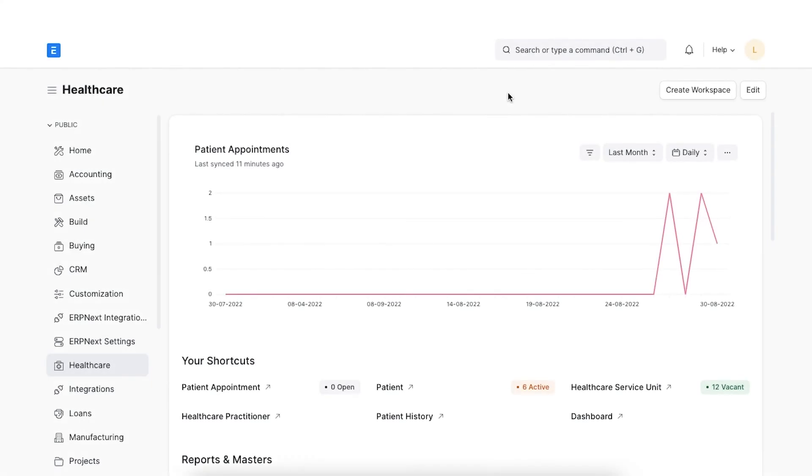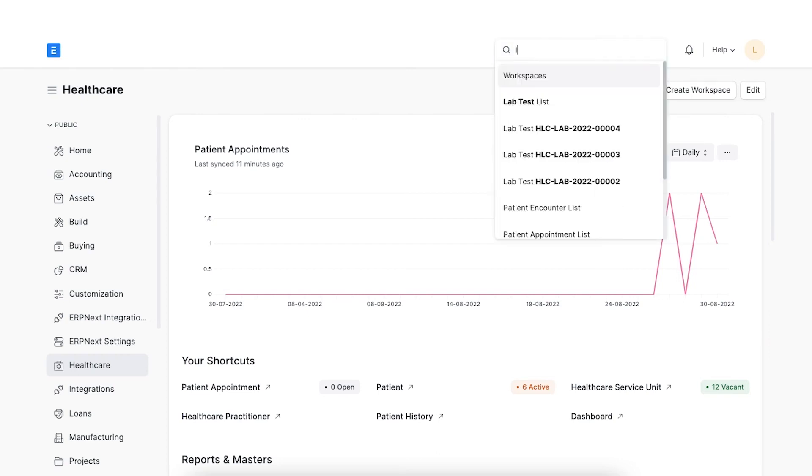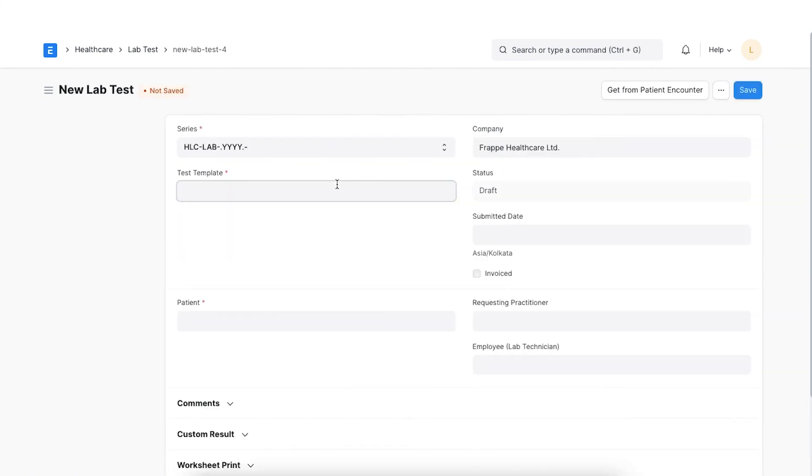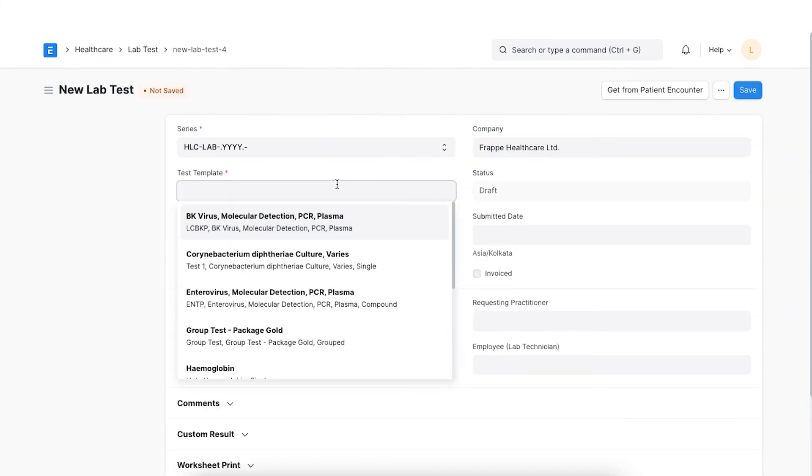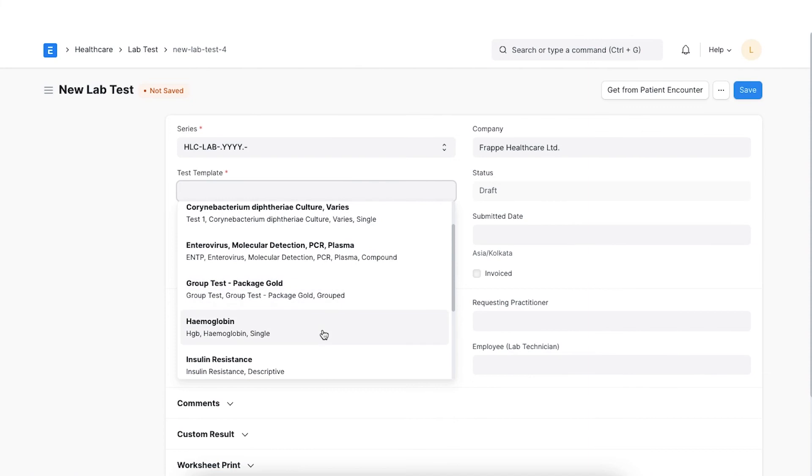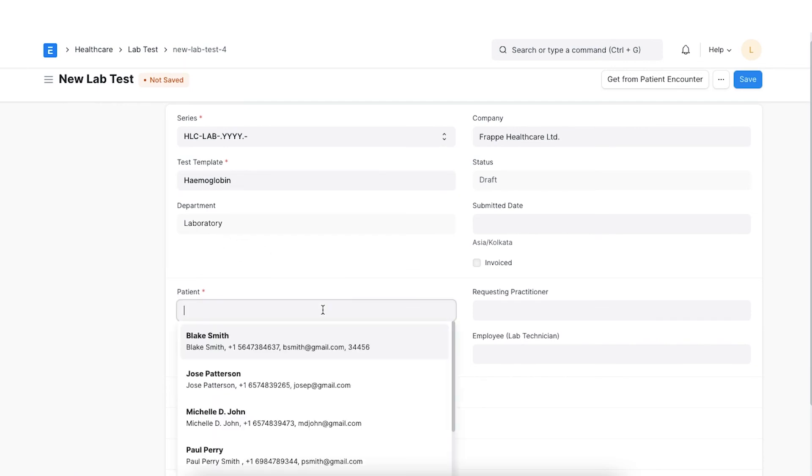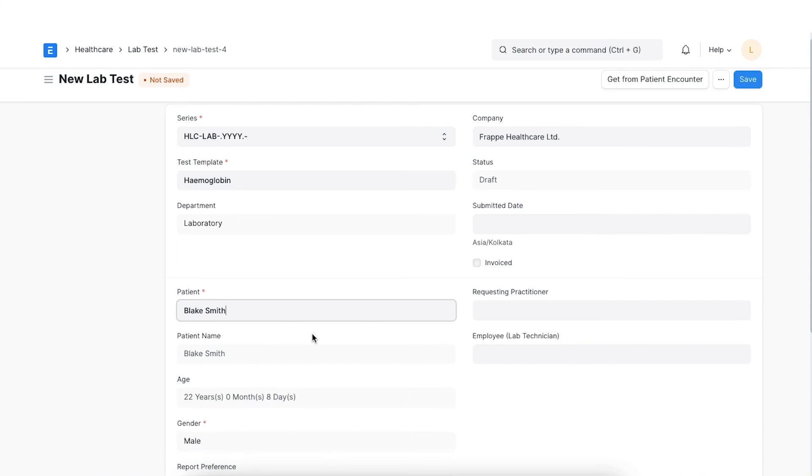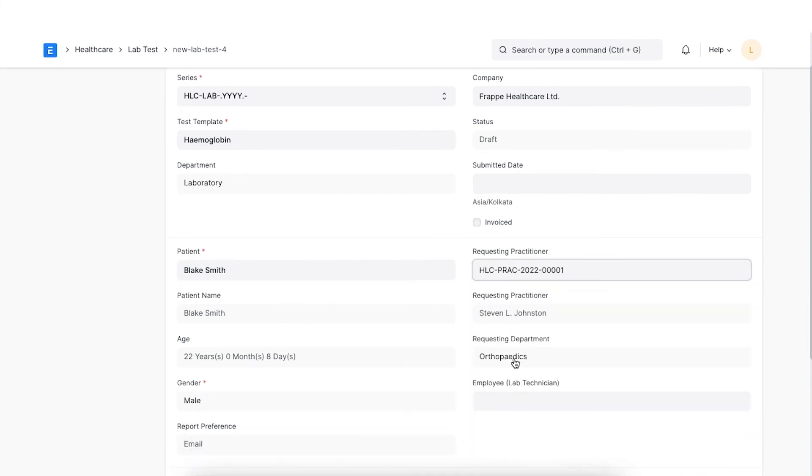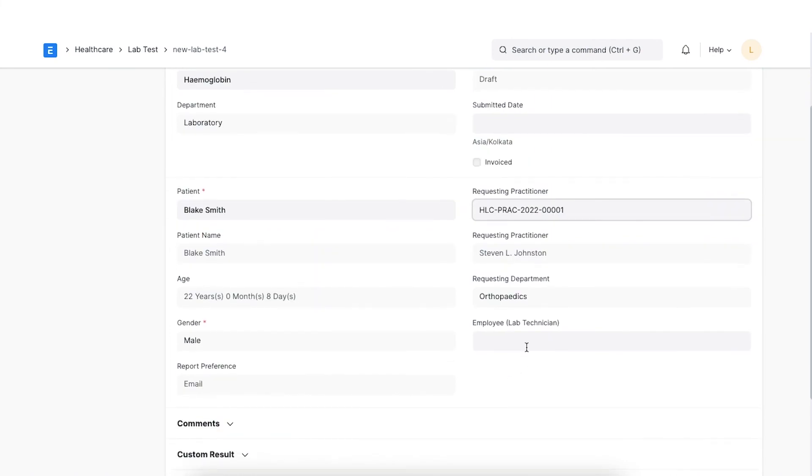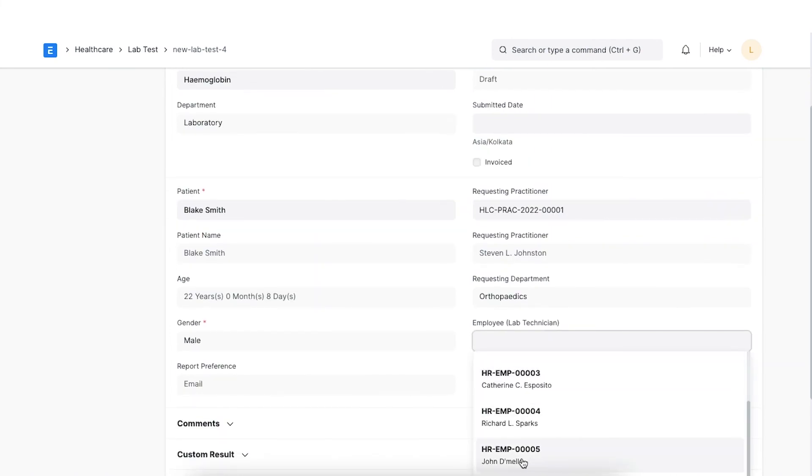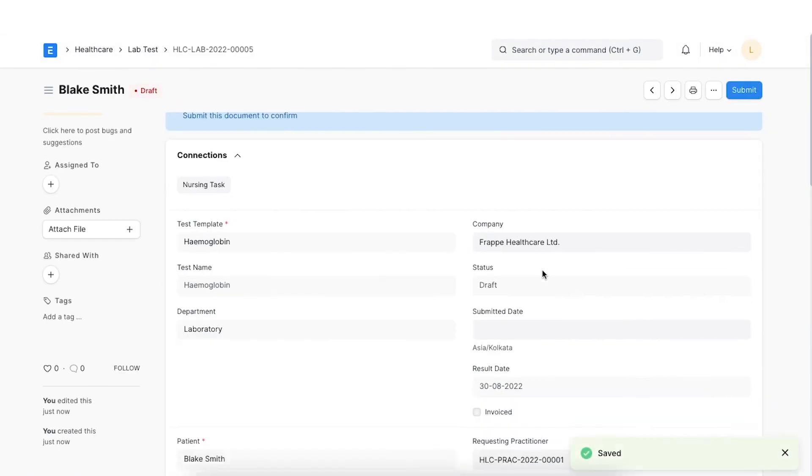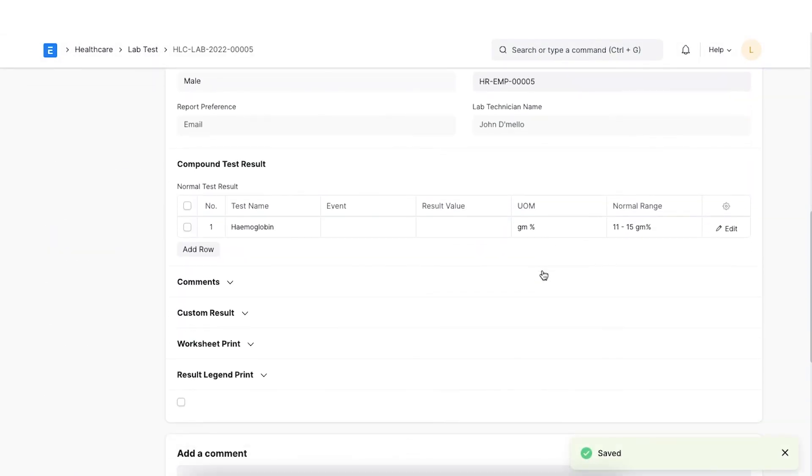Once we have all the necessary lab test templates configured, we can start creating lab tests by selecting a test template to create the lab test. Let's go to lab test from the awesome bar and click on Add lab test. Set the naming series and the lab test template we just created. The medical department will be automatically fetched from the template. Once we select our patient, their details will also be auto-fetched. We can select the practitioner and the lab technician here. Once we click on Save, all the data configured in the template will be fetched and set in the lab test document.